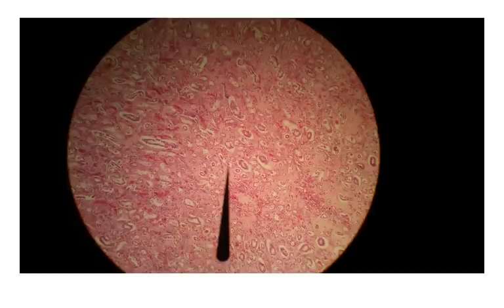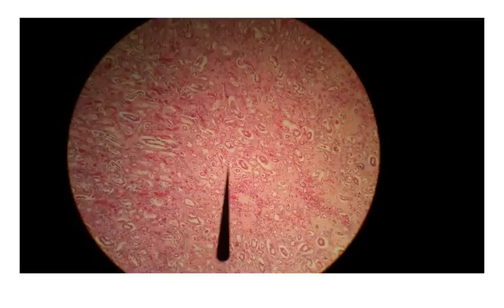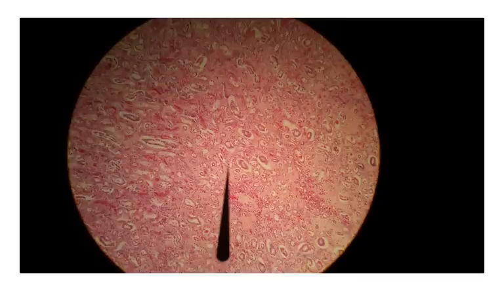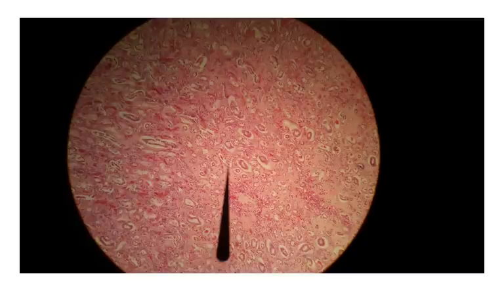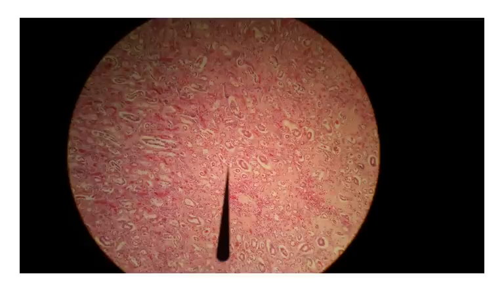This final slide — see if you can tell what we're looking at. What we have here are lots and lots of rings of simple cuboidal epithelium — so these are renal tubules or kidney tubules. But what don't you see anywhere on this slide? No renal corpuscles — no glomerulus, no Bowman's capsule. That should tell us this is a deeper part of the kidney — the renal medulla. That is something you'll need to recognize for your second lab exam. I hope this all made sense, and feel free to contact me with any questions. Good luck on your exam.